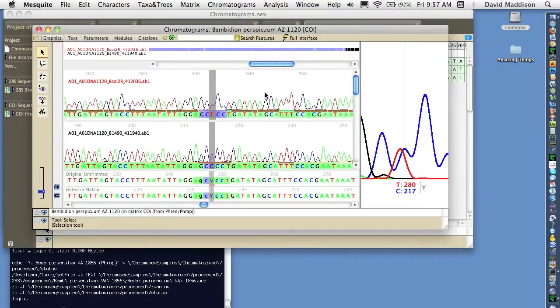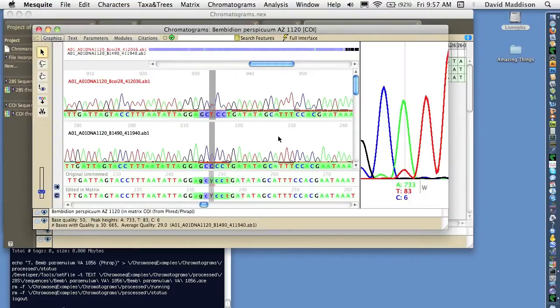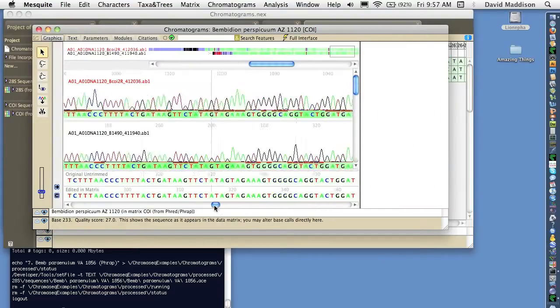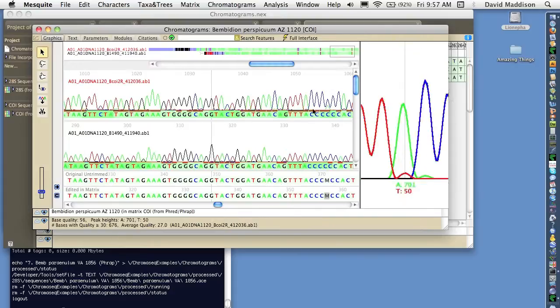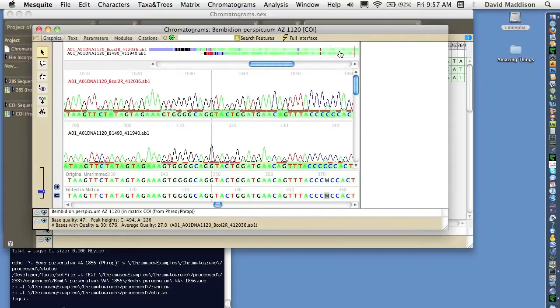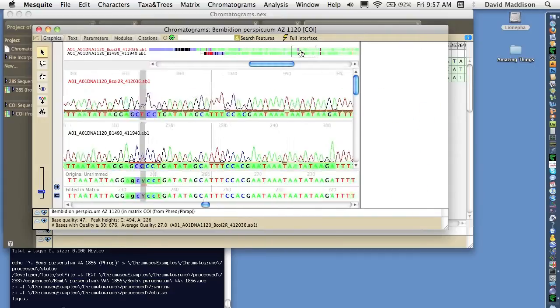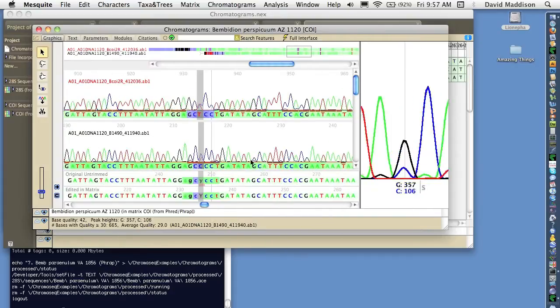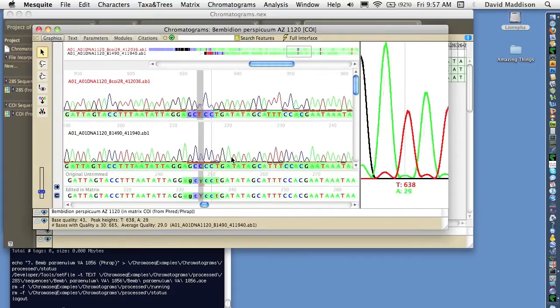Here we've got two of the chromatograms associated with one of the contigs. We can scroll through. We've got a little overview window up here. We've got a little close-up window on the right.